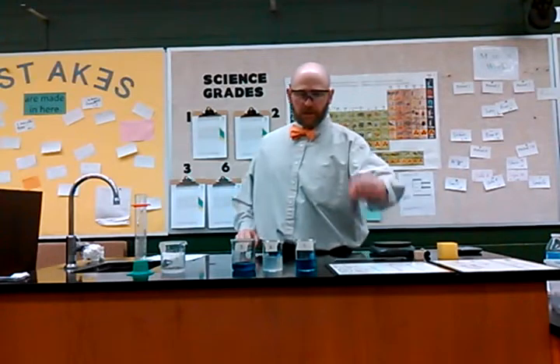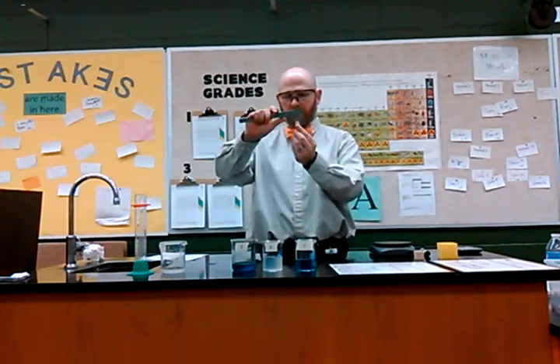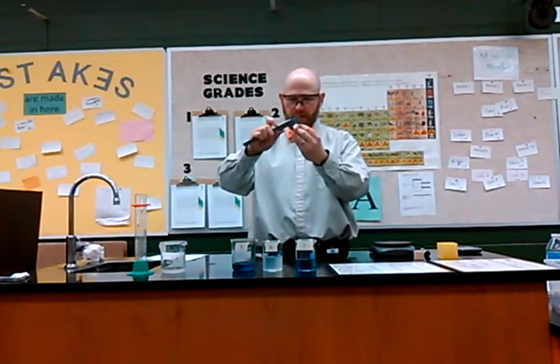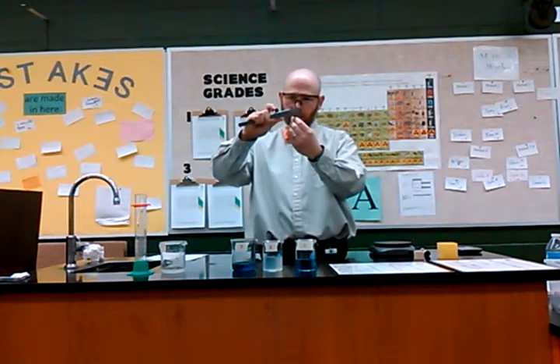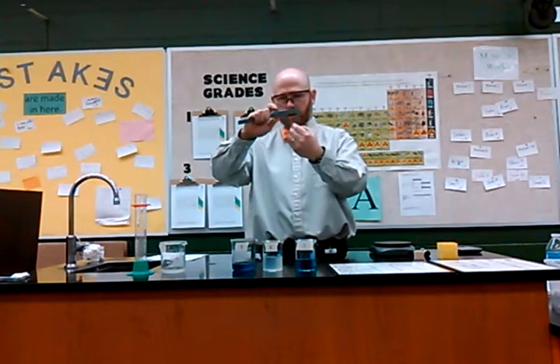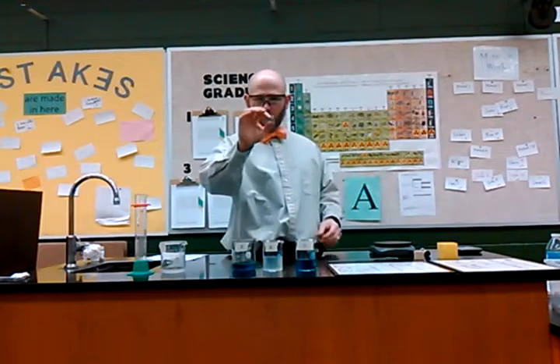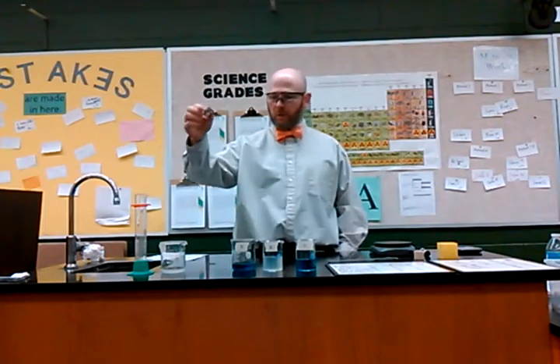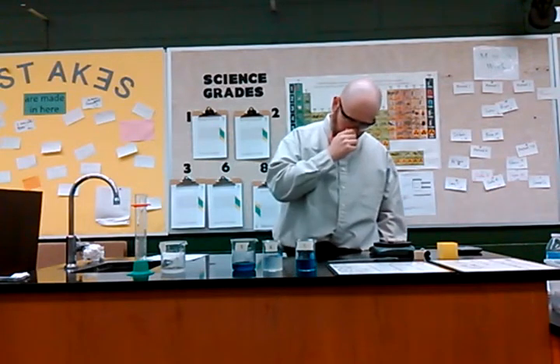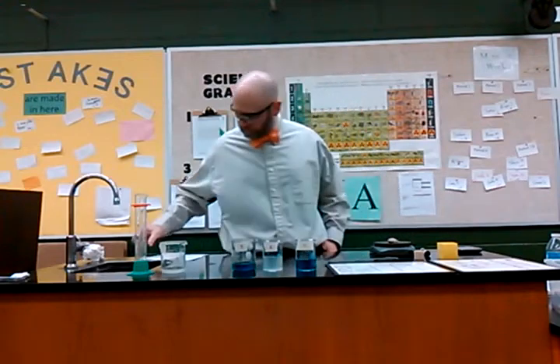Our last object is a rock. To determine its volume, however, will be kind of difficult because it is irregular. We will use displacement to determine its volume. But before I place this rock into a graduated cylinder with an amount of water, I will get its mass, and its mass is 16 grams.